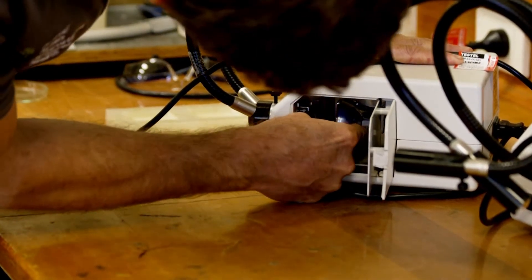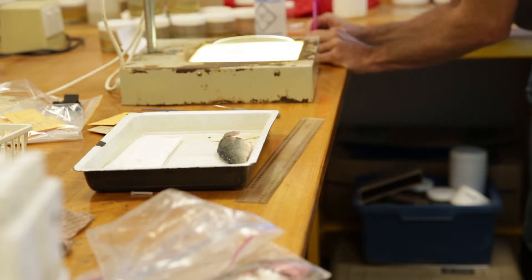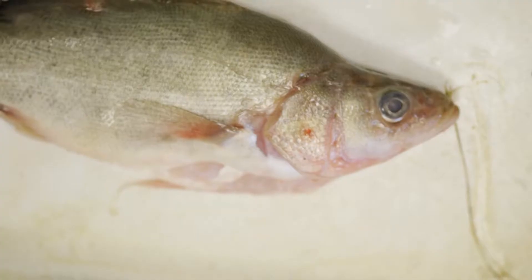We're going to run through what otoliths are, how to extract them out of a fish, how we prepare them, and the sort of information that we can get out of otoliths.